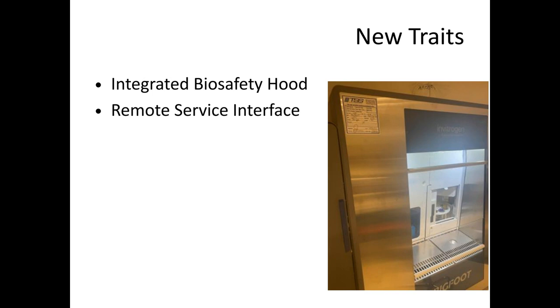They have this whole super complex user back panel that allows them to diagnose the machine remotely. And a lot of times they can fix it without ever even coming in, or if they do come in, they already know what's not working and the part's coming in with them. And with that, I think that has to be a trait that is a part of all future instrumentation, because the amount of time we've lost waiting for service just as a function of reducing, I'm making air quotes, "optimized" manpower and service is a burden on the researchers.